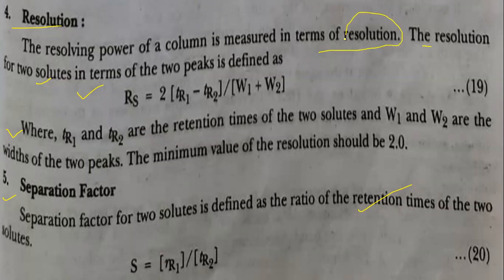The resolution of two solutes in terms of two peaks is defined as 2 into bracket TR1 minus TR2 upon W1 plus W2. TR1 is the retention time of solute 1, TR2 is the retention time of solute 2, and W1 and W2 are the widths of the respective peaks. The minimum value of resolution should be 2, and maximum any value, but minimum should be 2 to get the proper separation of the components from each other.